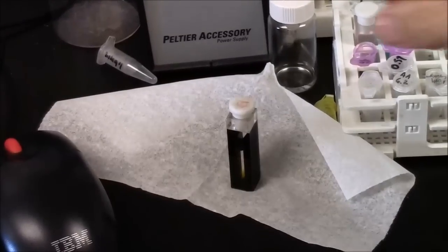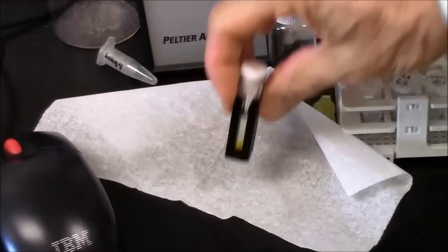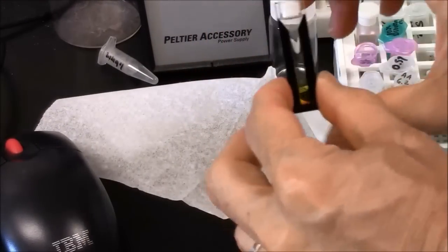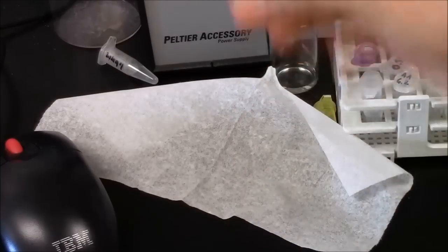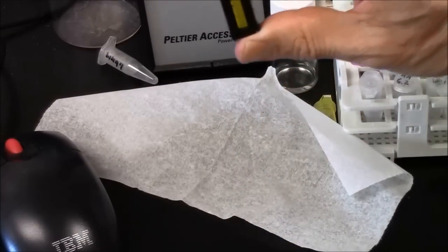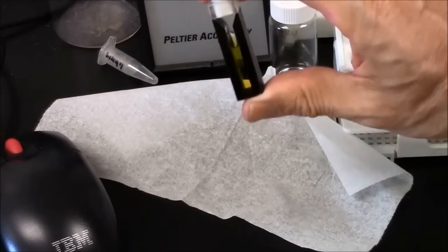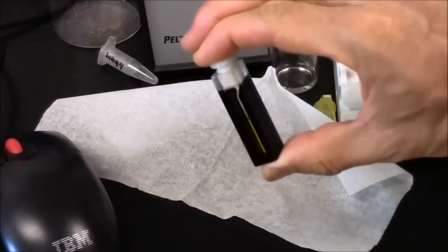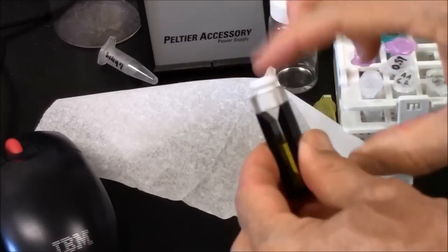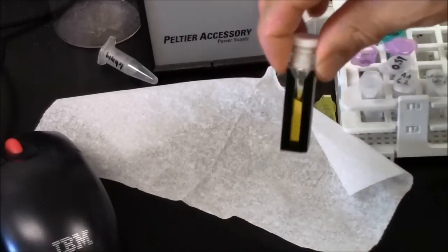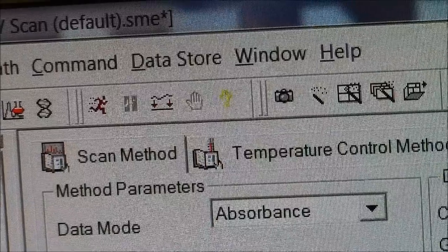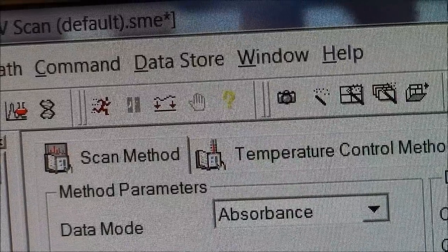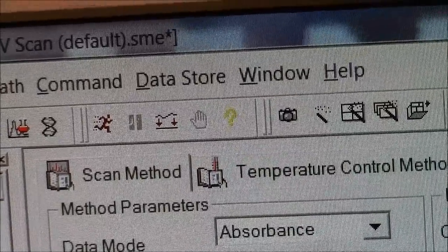To take a spectrum of a molecule of interest, usually you dilute. So I added 5 microliters of a fairly concentrated solution to this cuvette. I mix it by inverting. I have a stopper on the top. This is now ready to take a spectrum. So I've placed my cuvette in the machine, same as before.